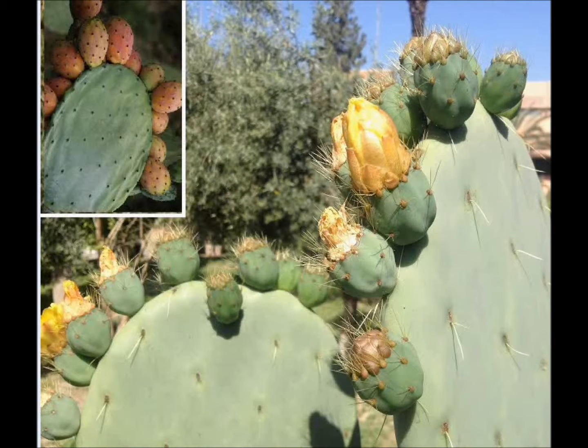This work, New Investigations on the Guaiacol Peroxidase of Opuntia ficus indica and its modulation by ascorbic acid and copper, towards an optimization of quantitative and qualitative tests, was carried out on many ecotypes of the cactus Opuntia ficus indica collected in Morocco, North Africa.